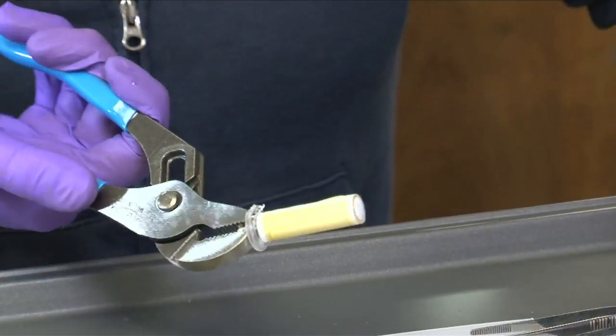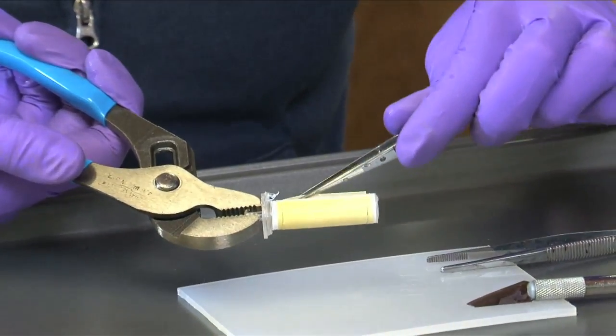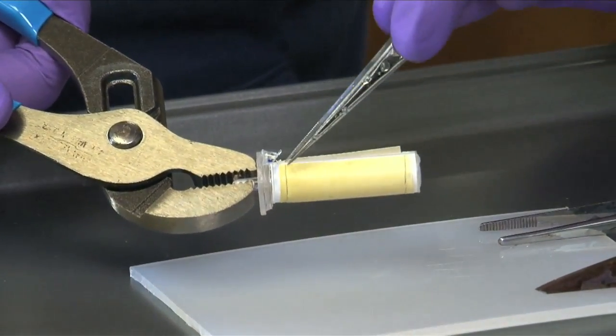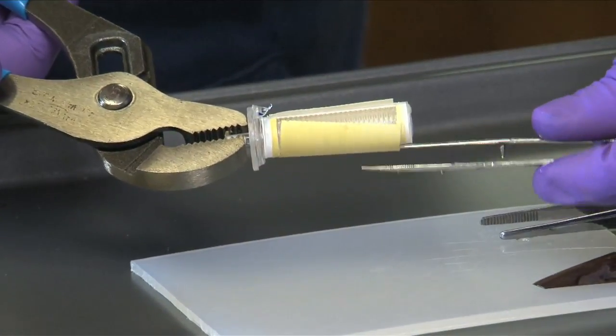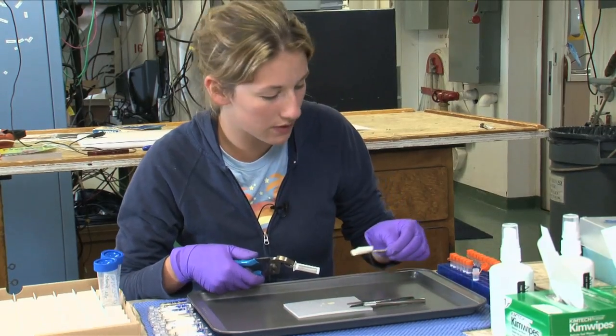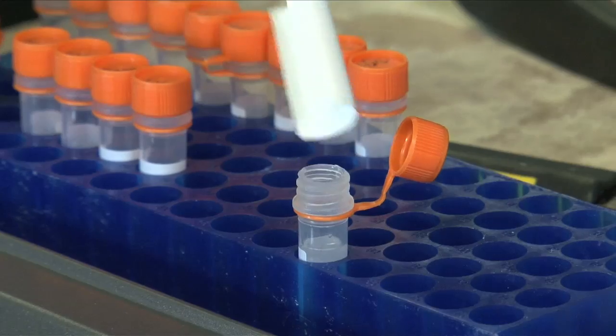So once you've got it cut, you can use tweezers to start taking it off. You really want to minimize exposure and not touch the filter with your hands or any other non-sterile tools. You're going to have a little bit of liquid that you kind of want to save — it's okay if you don't get all of it in there.